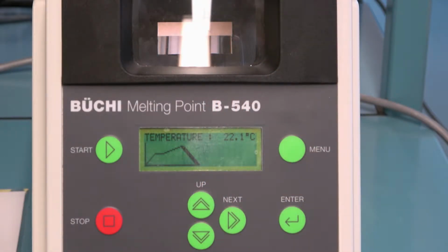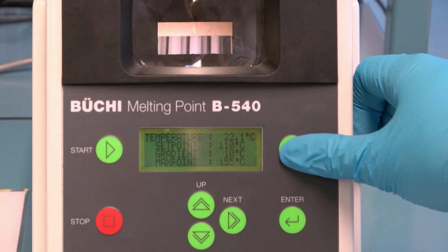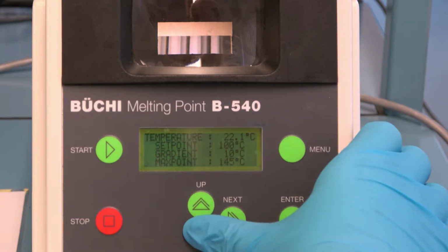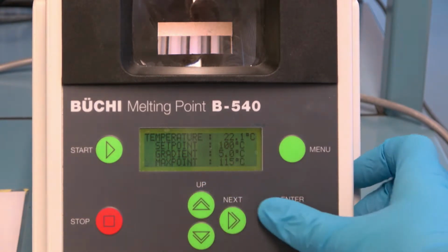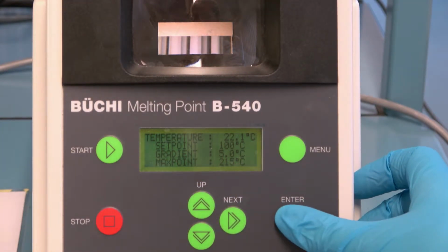After turning the instrument on, the menu button is pressed. From there, the settings can be altered with the arrow keys, choosing the set point, max point, and the gradient for the sample. The set point should be at least 10 degrees lower than the theoretical melting point for the compound being analyzed. For the first run, the gradient can be higher, or 4 to 10 degrees, but should be lowered when possible to get a more accurate melting point.